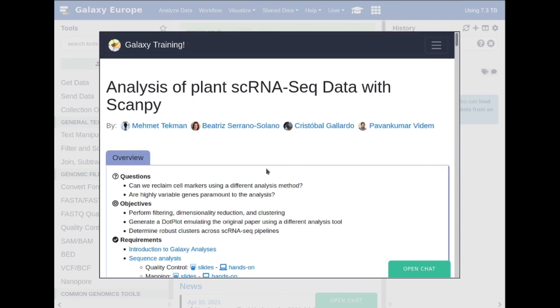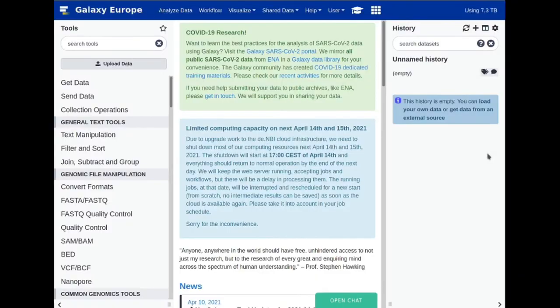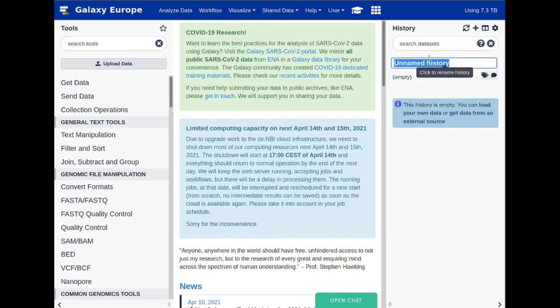For now, what I would like you to do is to copy the title of this tutorial, click outside of the learning rectangle, and then create a new history. You can create a new history by clicking on this, and then rename your history by pasting the title of the tutorial we will be discussing.